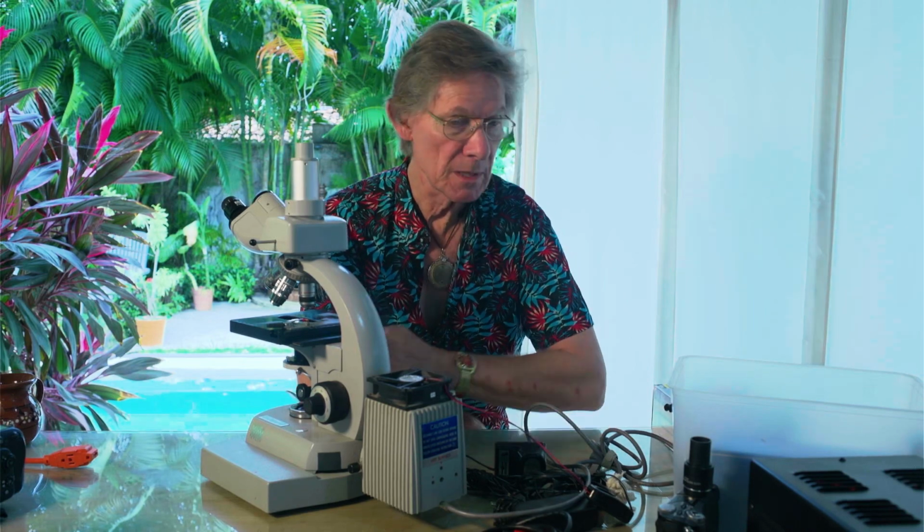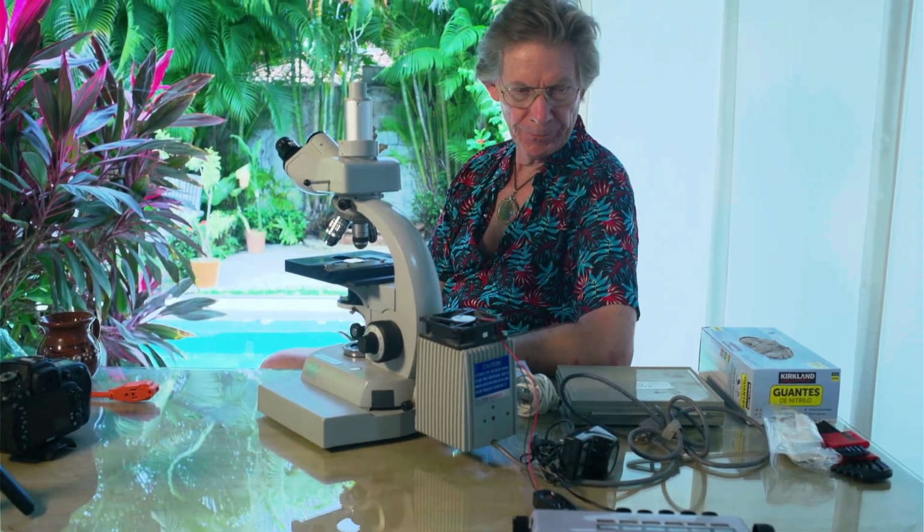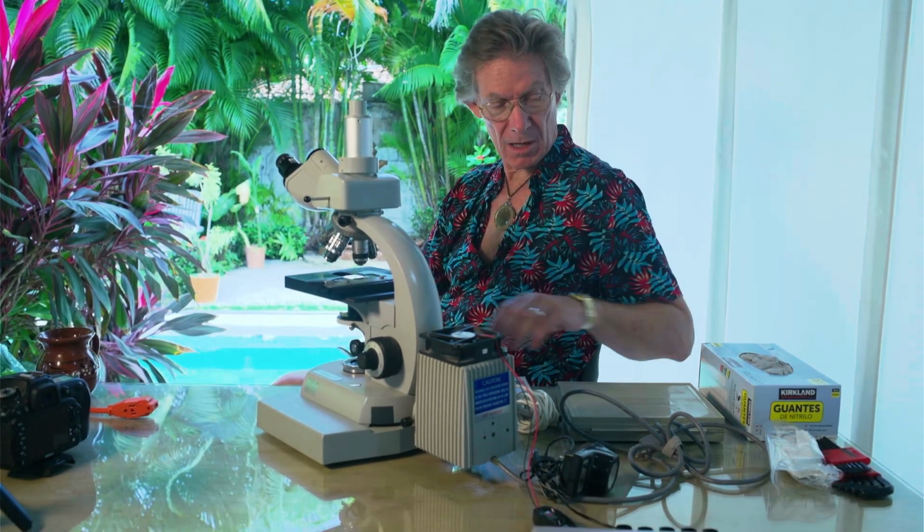And I will talk about something very, very important right now, and that is the sample. And the sample is the drop of blood on the microscope slide. So let's go over that. Creating an image of blood with the microscope. There are some things that we need to do that. Let's talk about what we need.